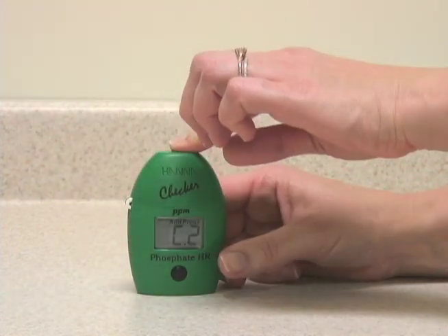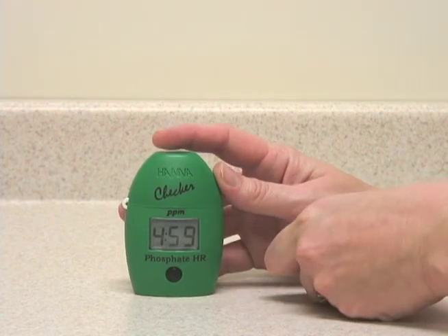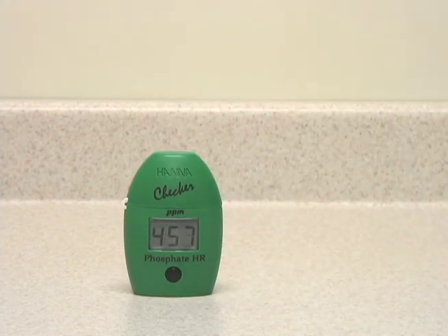So now we will put it back in the meter and press and hold the button to activate the timer function. The checker will now count down a five-minute reaction time.